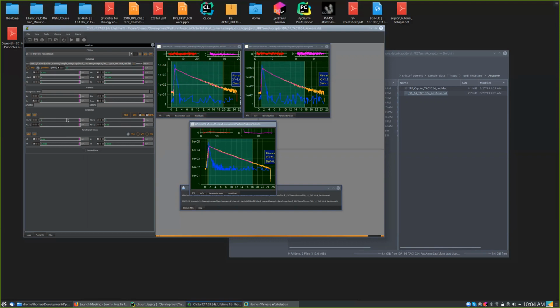But like you said, this wasn't a pi measurement. Maybe you should check what this bump could be, because I don't know. Yeah, I agree. Okay, so I just add, let's say for a start, two lifetimes, and see that it fits more or less. Here the beginning doesn't fit very well. The reason is this bump. Just to try, I could add a third lifetime, but no, it doesn't improve.